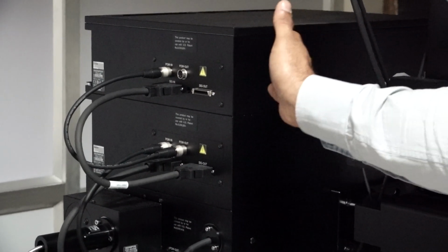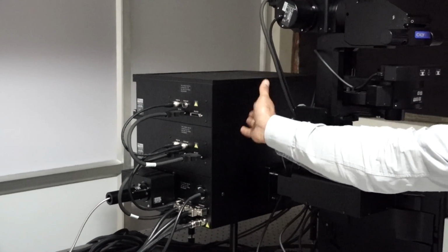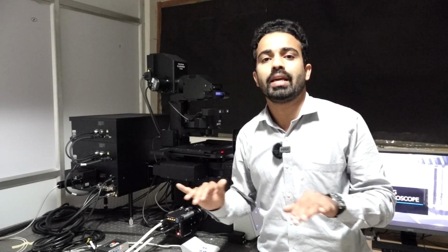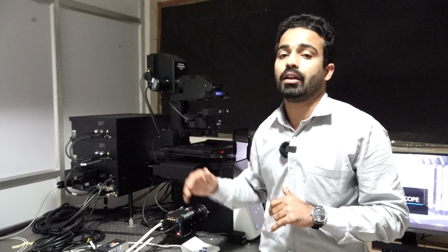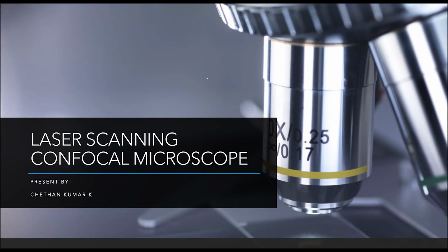This instrument is equipped with two scanners, namely resonance scanner and galvano scanner. So the galvano scanner will slowly scan the sample, and the resonance scanner will scan very fast, so that the resonance scanner will be used for live cells. So these are the contents I would like to cover with you.